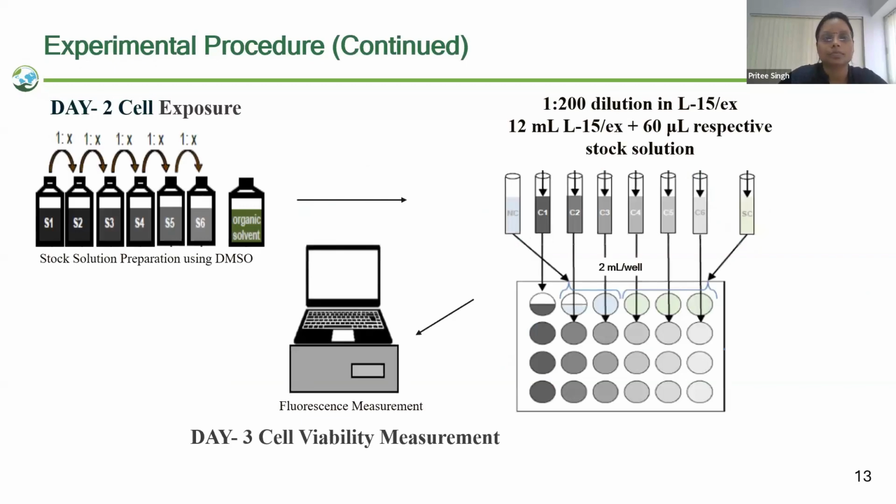On day two of the experiment, before preparing the stock solutions, it is mandatory from the guideline to observe the cell confluency. If the confluency is observed, then we can go for the treatment. But if the confluency is still not reached, then we have to keep it for another 24 hours. So here at JRF, we did 21 trials. Among these trials, on the next day, we obtained the confluency. So we prepared the stock solution immediately after the cell seeding.